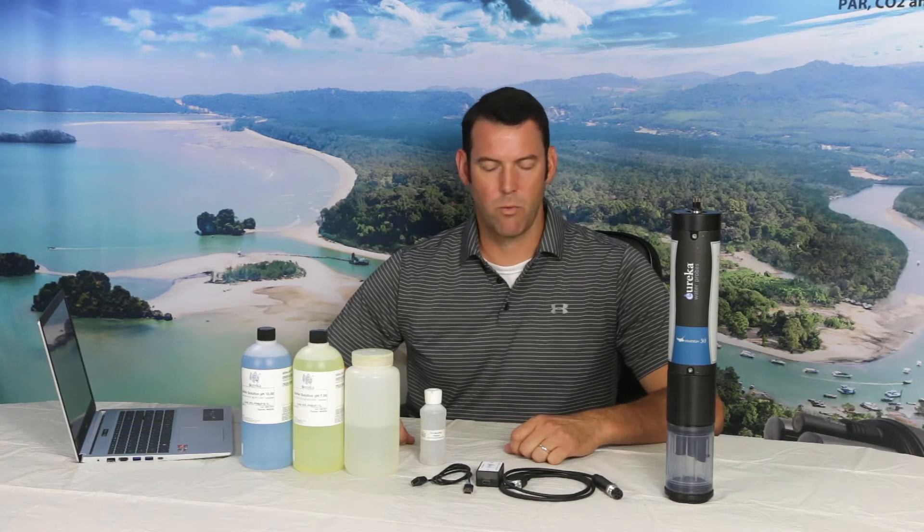First of all, this is a good time to clean your sensors of any foreign material that could potentially affect your pH calibration. For cleaning products, we use a mild soap like Dawn soap, warm soapy water, and a soft bristle brush. Works great.